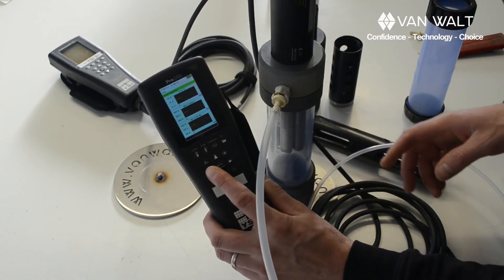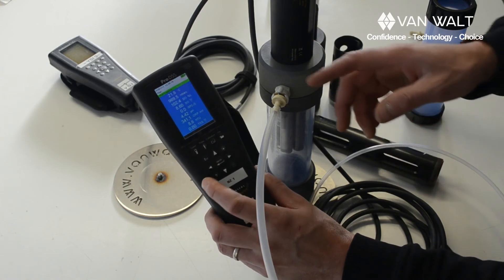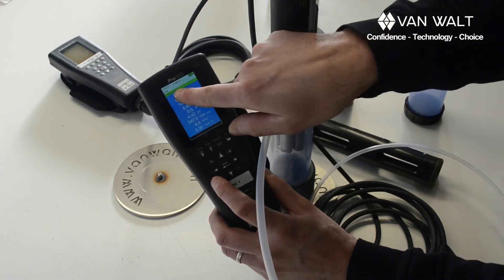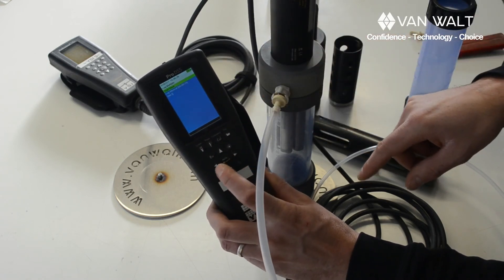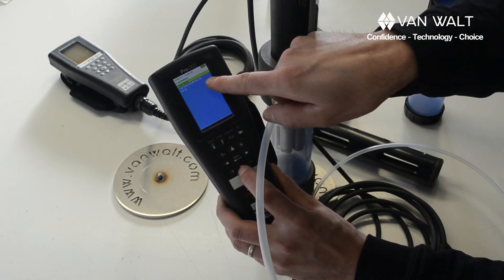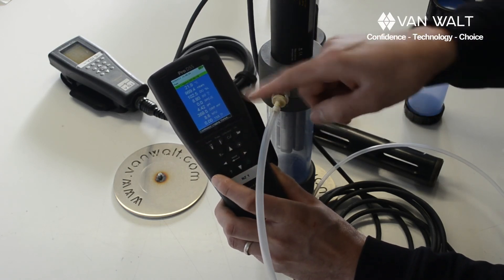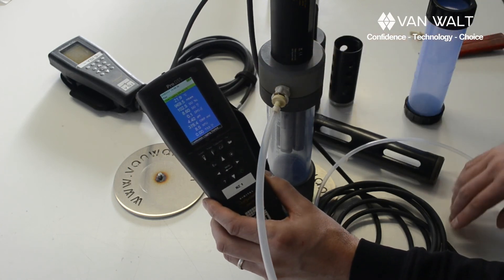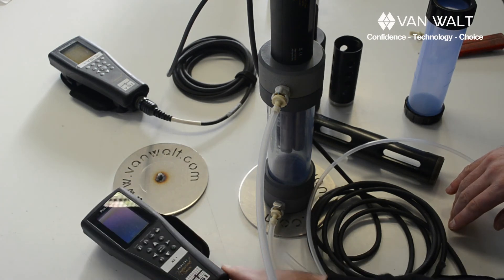Also now is a good time to remind you about the logging function. It already says start logging. If I press the enter button I can do start now at the interval — it says 15 seconds, and I think I can change that as well. So that's handy — it will log away instead of having to write the numbers down in a book.